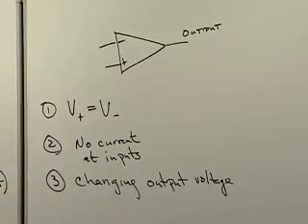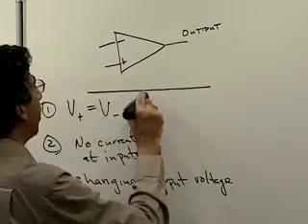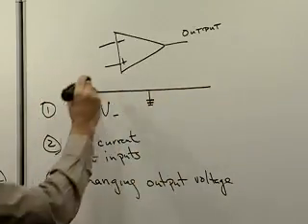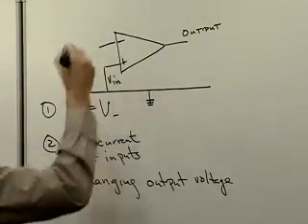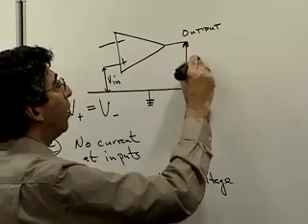So you can take this device, and as its name suggests, you could build an amplifier out of it. You could use it for doing integrations of currents. You can use it for current and voltage converters, all this wonderful stuff. What it depends on is the sorts of resistors and capacitors and whatnot that you're going to attach to the rest of the circuit. So we'll just look at one configuration, a non-inverting amplifier, which is what's used in terms of controlling your potentiostat. Okay, so the idea is that we are going to set a line at ground down here, and we'll apply a voltage over here, V in, against ground, and that will generate a voltage over here, V out.